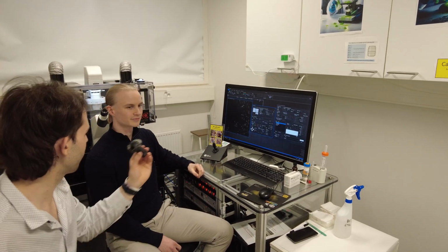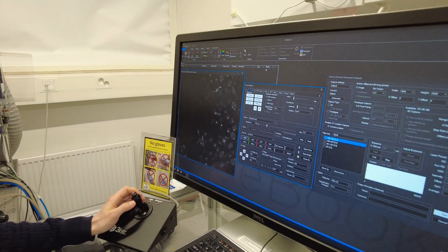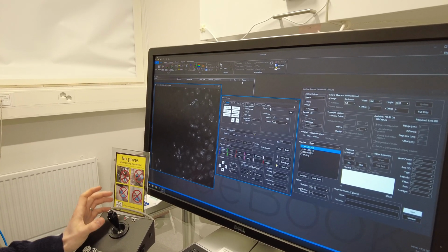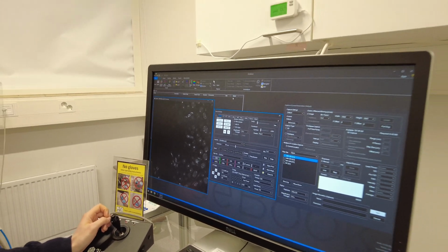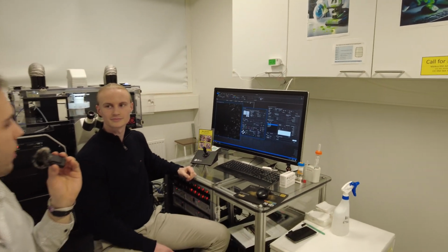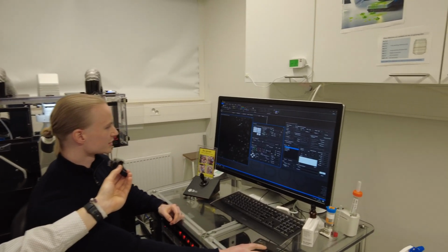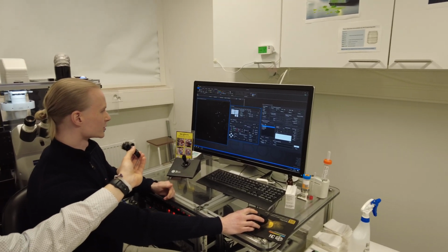And what are those lighter dots and darker parts? What is this exactly? Yeah, so here we see the nuclei of the cells, where the DNA is located. What we see as the brighter spots is the compacted DNA chromatin. Wow, that's so interesting. And is this a bright field, or is this fluorescence right now? This is a fluorescence image, and on the other channels we have other proteins that we have labeled with fluorescent labels.